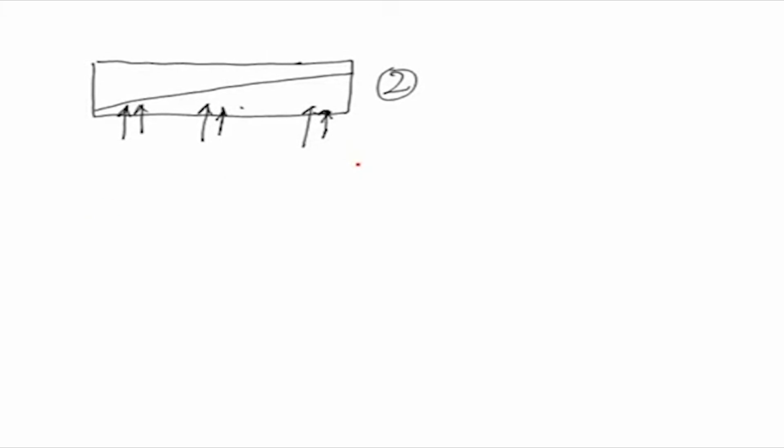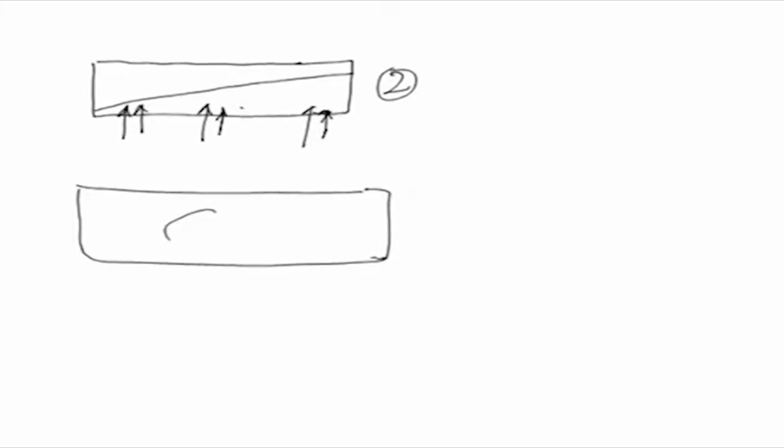Before it passes through the specimen, both are perpendicularly oriented. The specimen will contain a lot of things, like the cell I have shown you earlier, which contains different things. The light which is passing directly will not be changed so much in phase, but the light which is passing through here will actually be changed in phase.